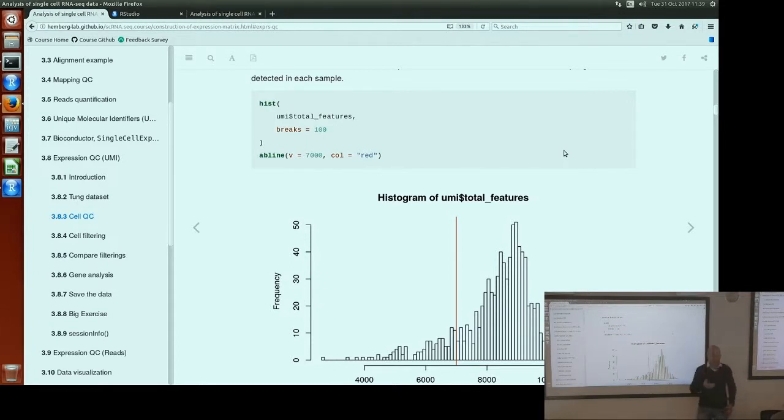There are normalizations for gene lengths. We'll consider this in the next chapters when we look at the normalizations. As for the advantage of using this one against the previous one, there is no advantage. I think we should use both, because these are the first 2 main features that you can look at in your data set. It gives you the idea of your data set.